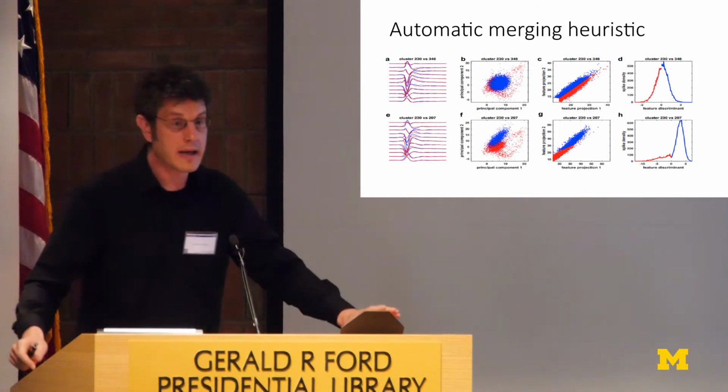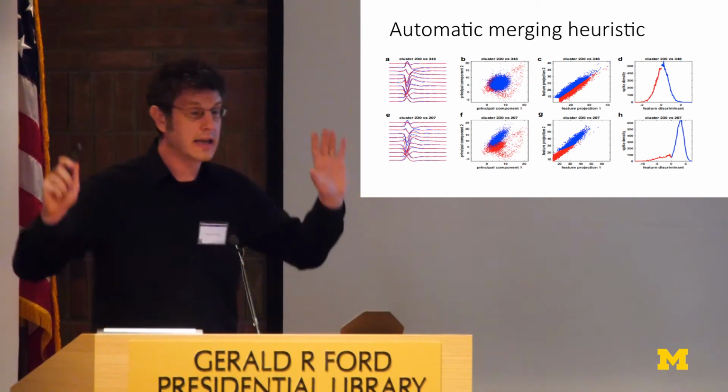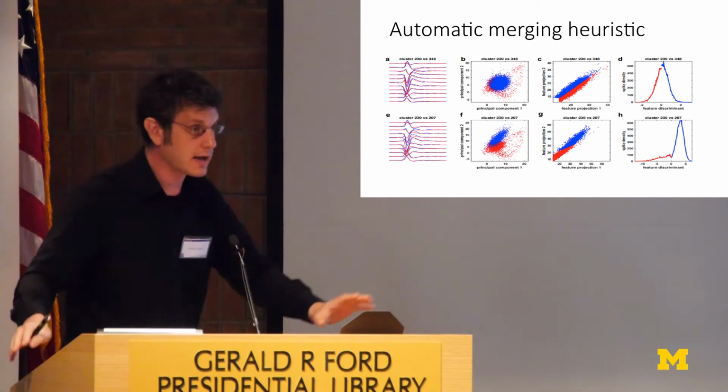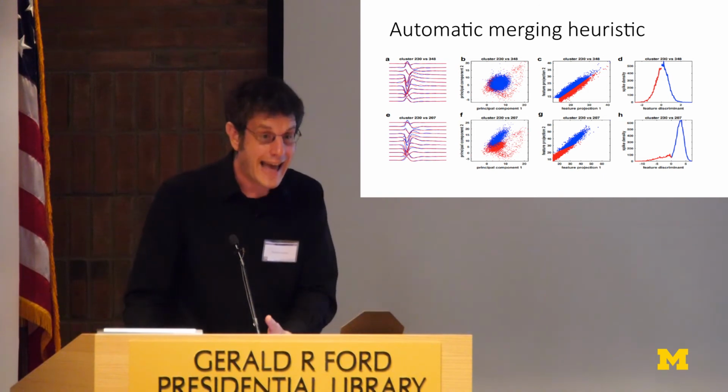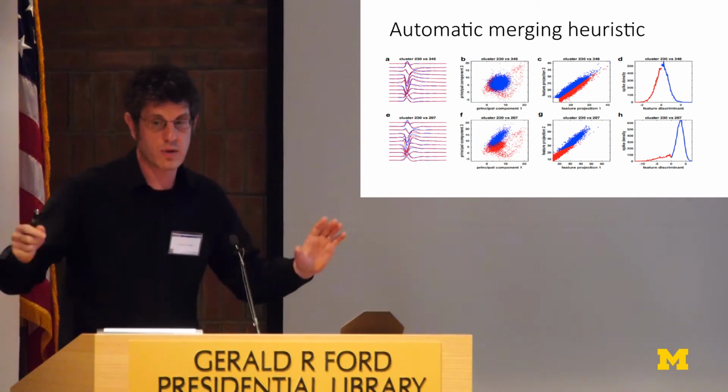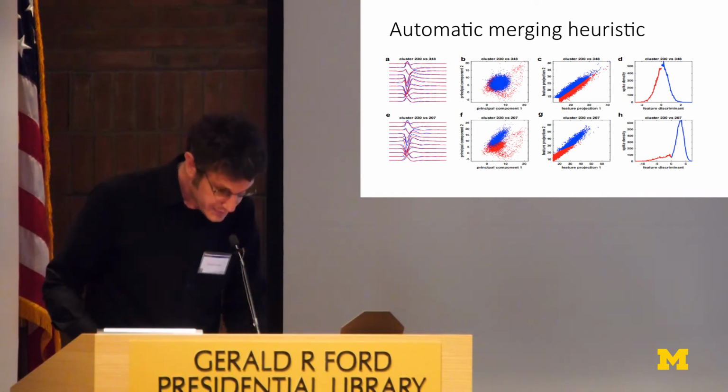And this can probably be improved, and hopefully with time, the manual clustering time, which now is something like several hours to a day for a long recording, will be brought down to ideally nothing.